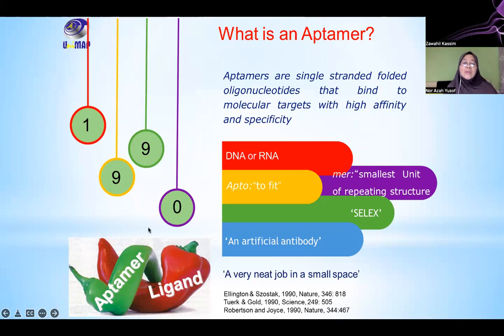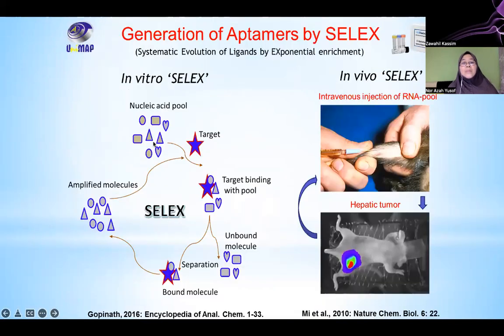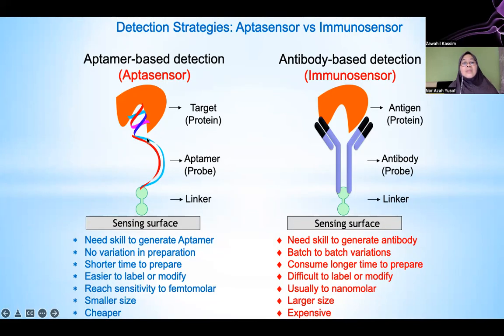So you can see here the example, and also we have these pictures. So this is the aptamer probe, and this is the sensor surface, regardless of what kind of sensor, and this is the target.